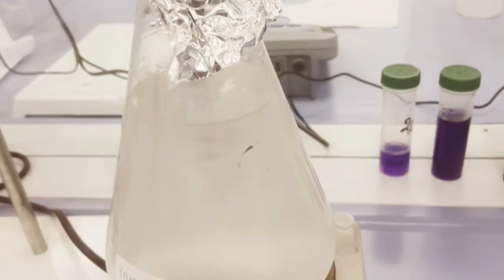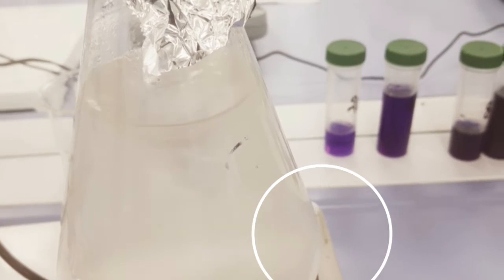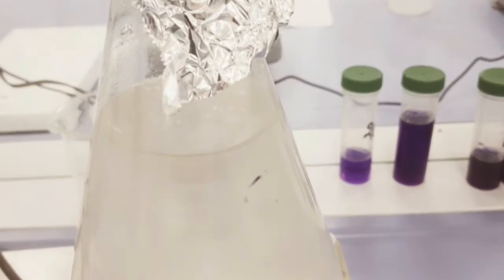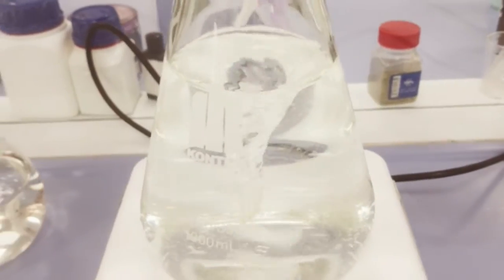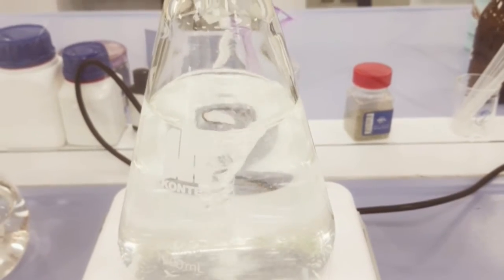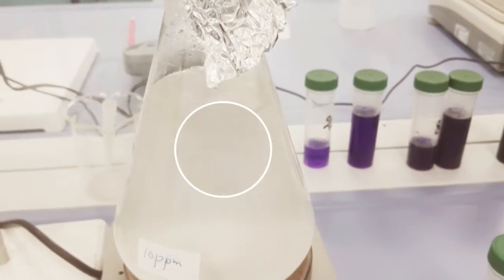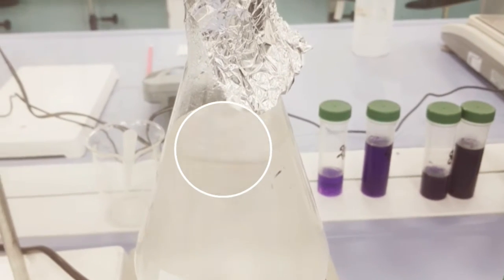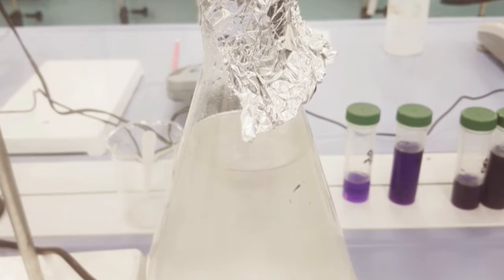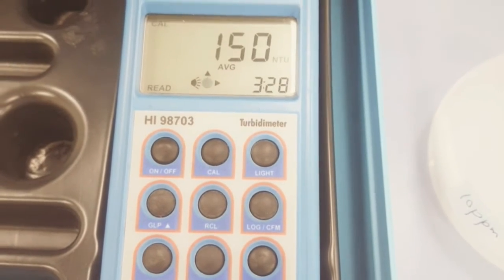This is my previously prepared emulsion. You can see the solution is very turbid. Based on the turbidity, we check the oil and water removal. You can see that it started to mix with the water, so we will leave it overnight. Now we will check the turbidity of this solution before starting the batch adsorption, or if you are doing column adsorption also, you have to check the turbidity of the prepared oil emulsion. The turbidity of the oil emulsion shows around 150 NTU.